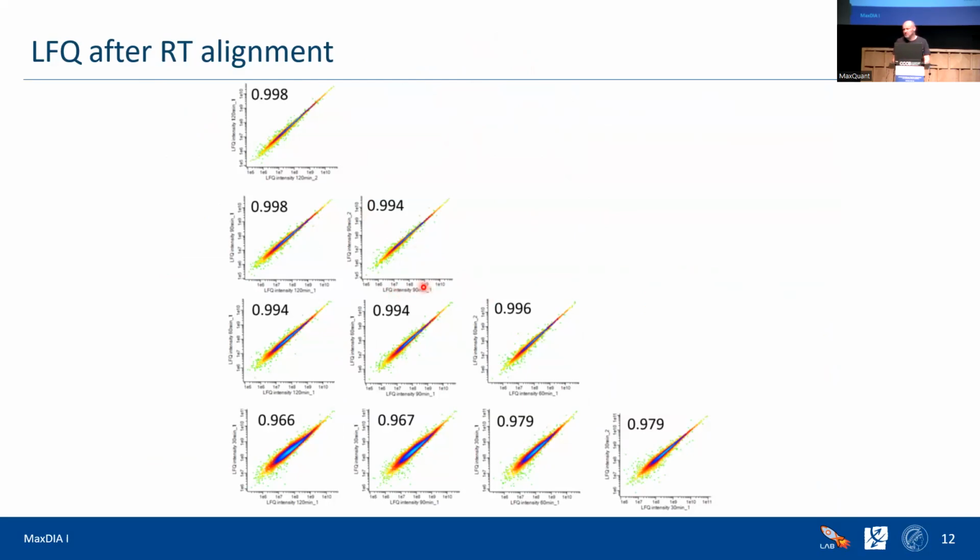I also have a question. Is it then performed with IRT peptides, or how do you match the retention times again? No, you don't need to use any exogenous molecules or whatever. This is just endogenous peptides in the sample, basically.